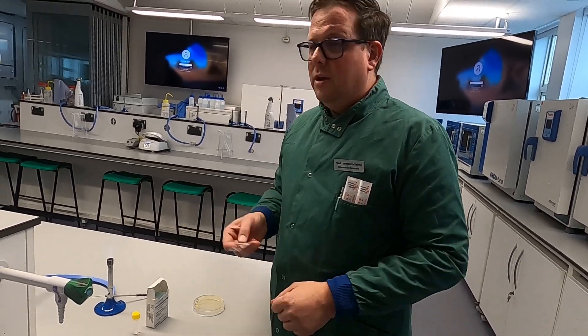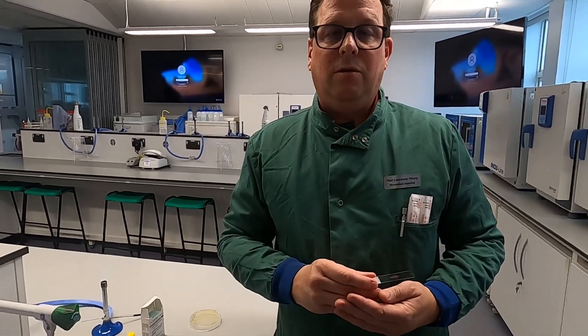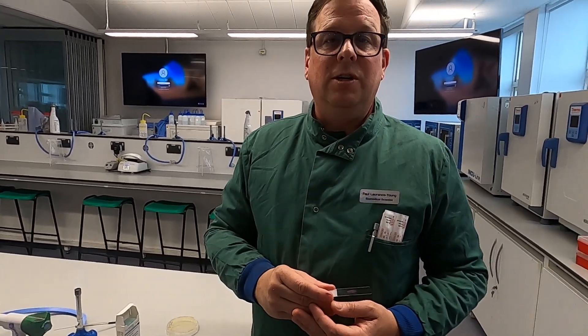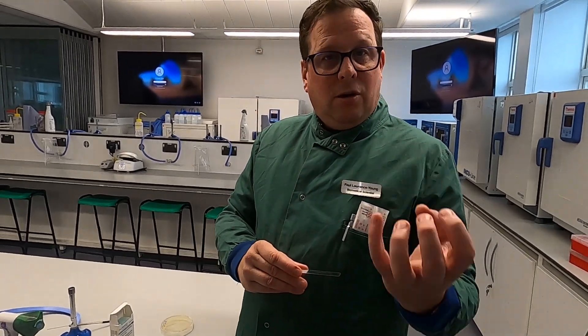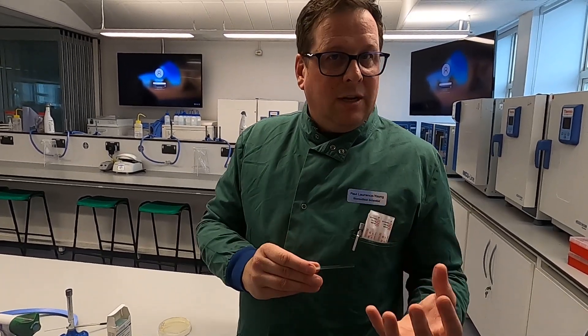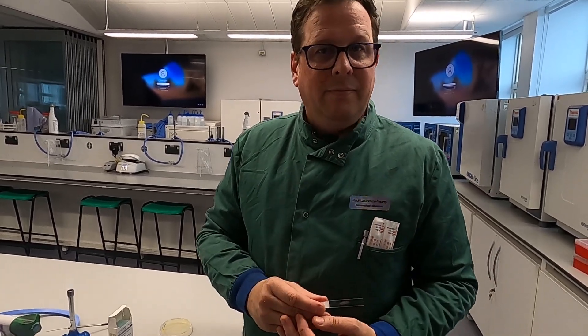When it's dry, you can then put it on the stage of your microscope and use oil immersion or a cover slip if you wish to examine and determine the morphology. Is it a coccus? Is it a rod? Is it something else in between? But most importantly, is it gram-positive — purple — or gram-negative — pink?